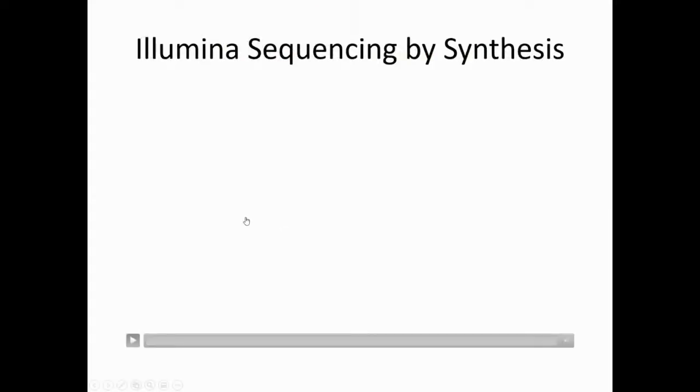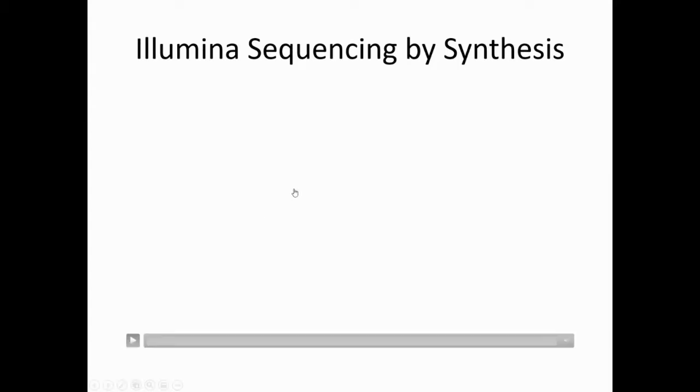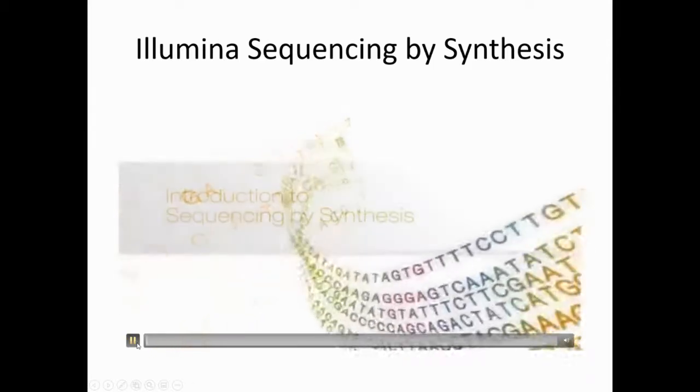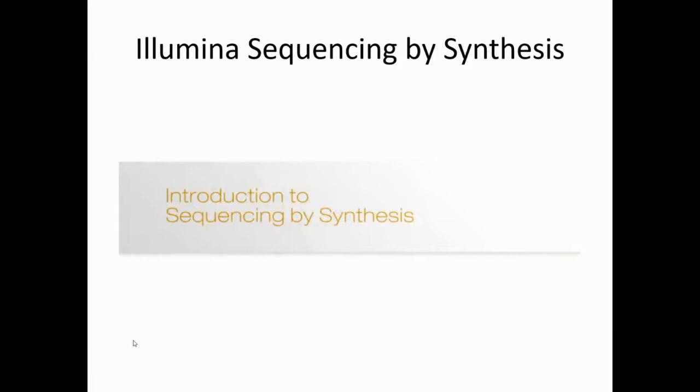And now, because this technology is very important, we are going to watch a video about this technology, okay? Oh, by the way, this technology is mainly used by Illumina, the Illumina company. And I will also discuss this later at the end of the lecture about Illumina.